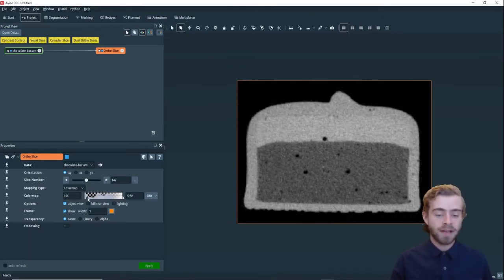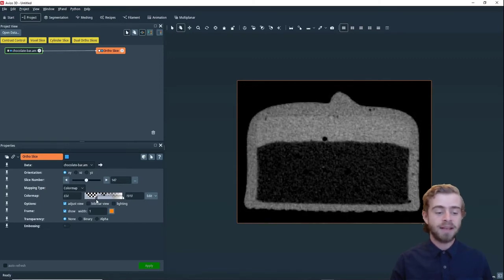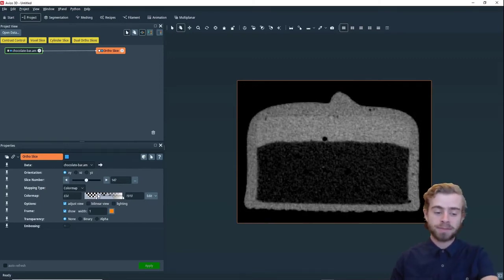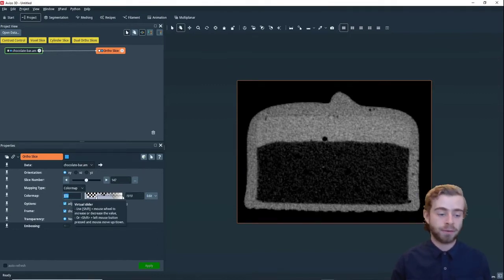So if we move this up some, what it does is anything below this bottom cutoff is turned to black. So anything below the intensity value of 654 is turned to black.